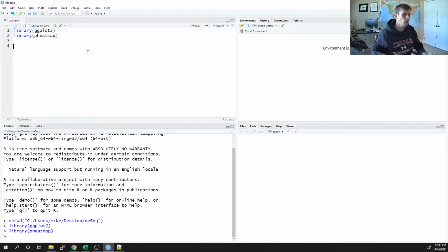All right, if we remember from Wednesday, I exported 2 different CSV files. I have this tradition of making the output files in one script and then plotting those output files in a separate script, as opposed to doing everything in one, where time gets a little restricted.